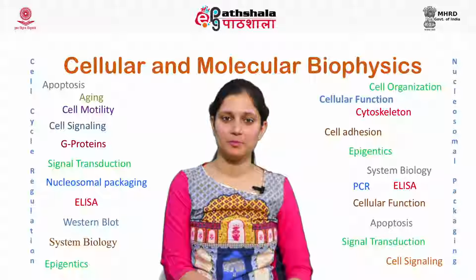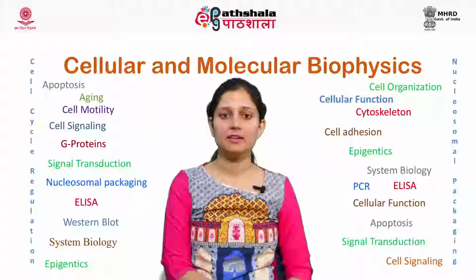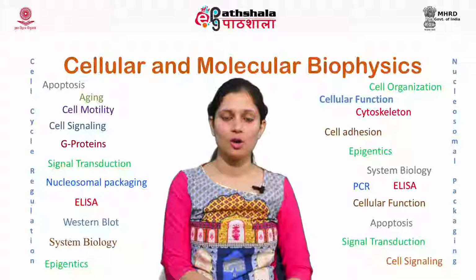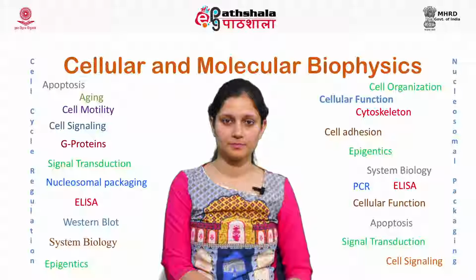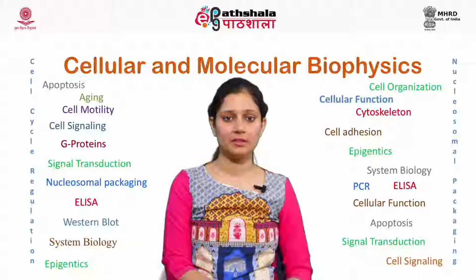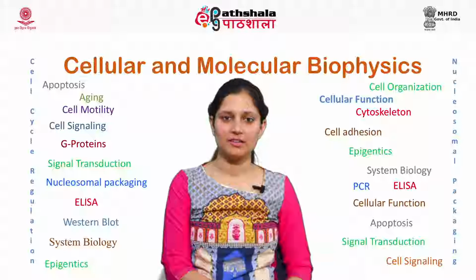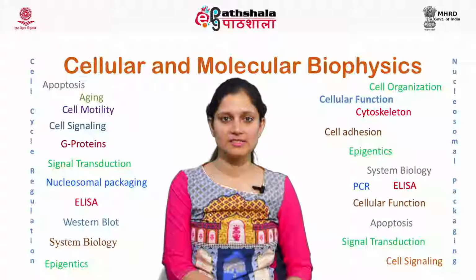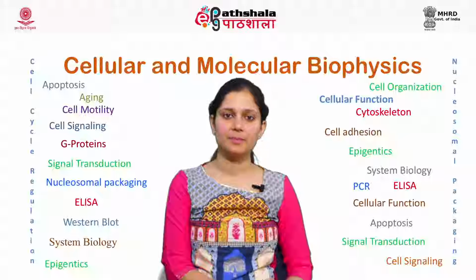After the PCR amplification has taken place, we have to check whether the desired PCR product has been formed or not. There are three steps that have to be taken care of. The first is to check whether the product is formed or not. The second step is to check whether the product is of the right size or not. The third important step is to see if there is specific amplification. All these things can be achieved by running the PCR product on gel electrophoresis.